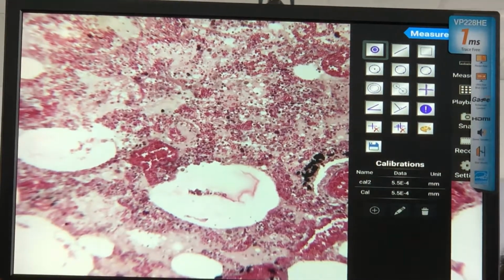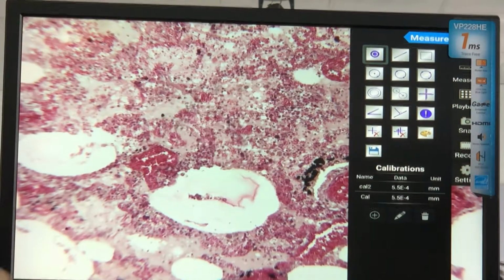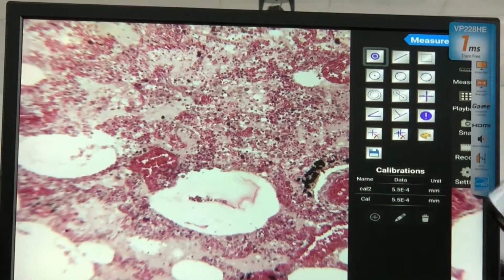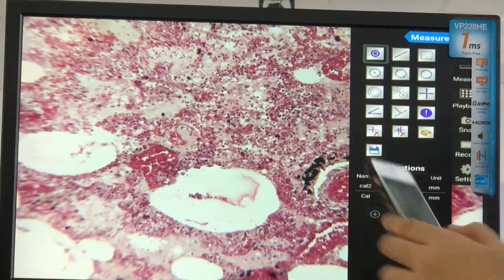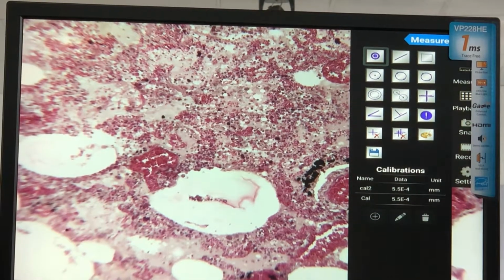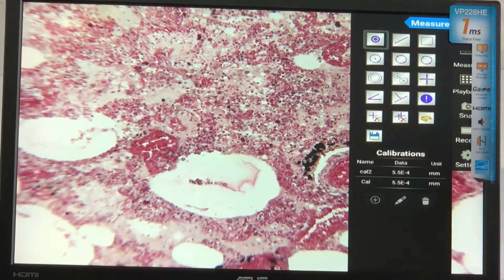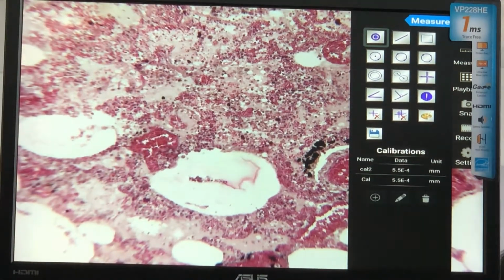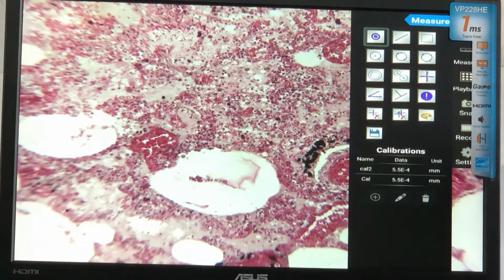You see those letters A, B, C, D? Memorize those features, because those are the 4 features you will see in your practical exam, which gives you only 45 seconds. You have to identify this in less than 5 seconds so that you will have time to make your analysis. If you can identify the slide in 5 seconds, you are in good shape. If you can identify the slides in 15 seconds, you are moderate. But if you take 35 seconds, you better hurry because I'm sure you will be late in catching the train.